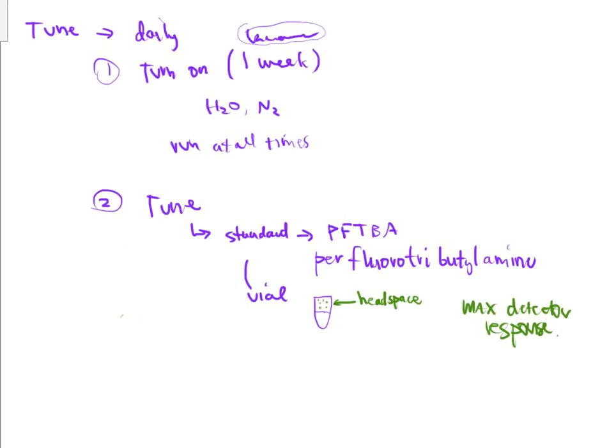All right, so now we've talked about the ionization chamber. We said the electron beam comes through and the fragment will maybe become a positive charge, and now we need to know what happens in the next step. Where does it go? What happens to these positively charged pieces?